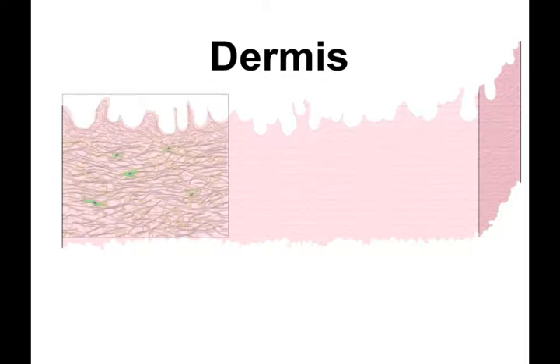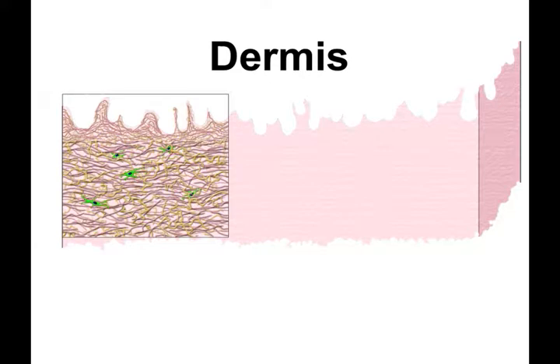The dermis is composed of collagen and consists of an upper, very loose papillary dermis and then a denser, bundled reticular dermis. The papillary dermis is noted extending into the rete ridge pattern, and below that the coarser bundles of the reticular dermis.